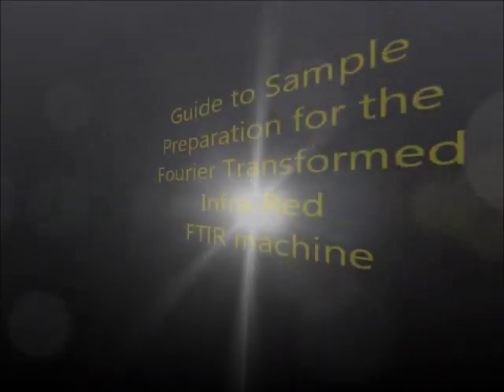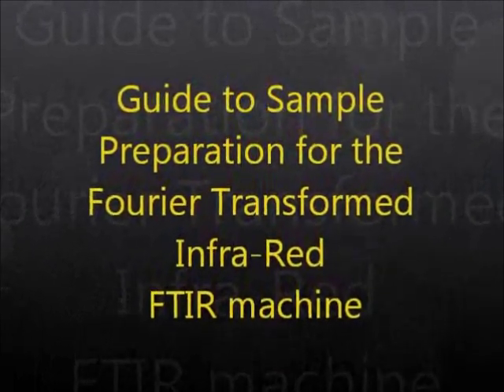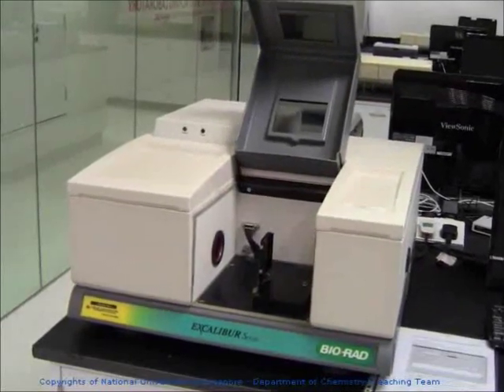Hi folks, this is the guide to the sample preparation for the Fourier transformed infrared FTIR machine. Here you see one of the three FTIR machines we have beside the synthetic lab for liquid samples.